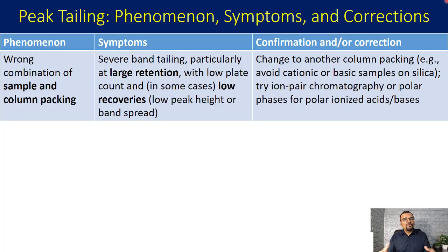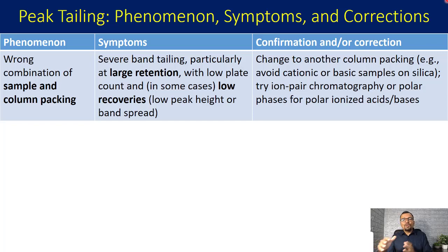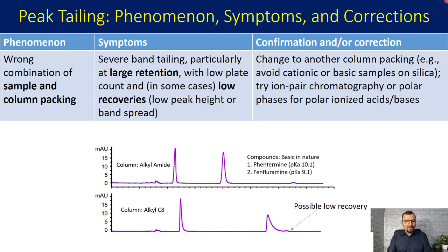The action you can take is to change the column. For example, avoid cationic or basic samples on silica columns. Try ion-pair chromatography or polar phases for polar ionized compounds like acids or bases. Let me give you one example.